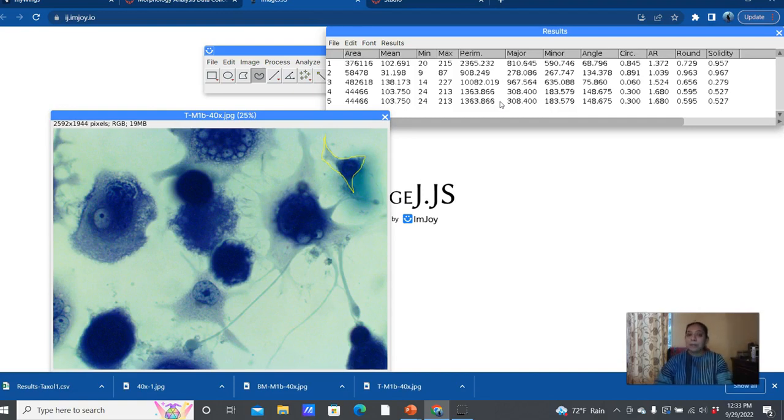In next week's lab, we are going to be utilizing the data that you collect this week. That's why we are continuing to stay on track with it, because we need this data in order to do next week's lab. But we will have time in class for you to visit the actual slides. I have all the slides saved for all the sections that we have prepared, or that you students have prepared yourselves, for example, Monday and Tuesday.